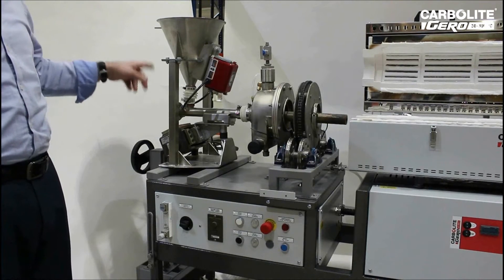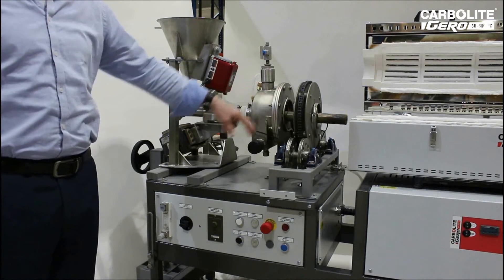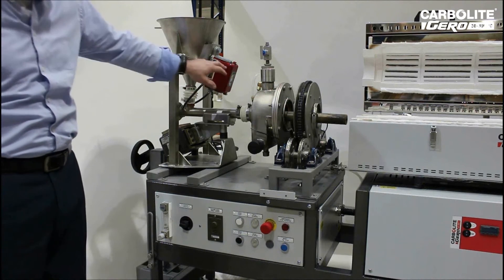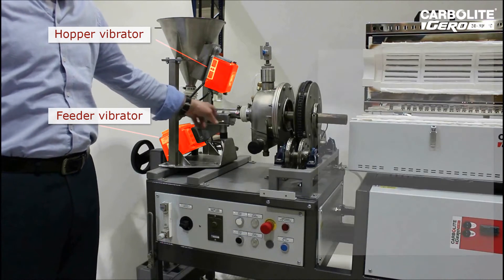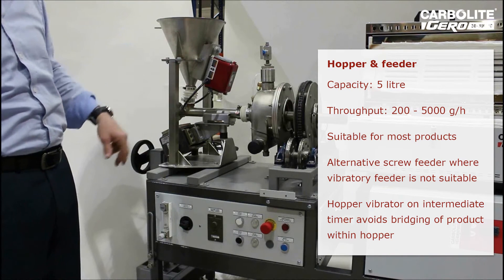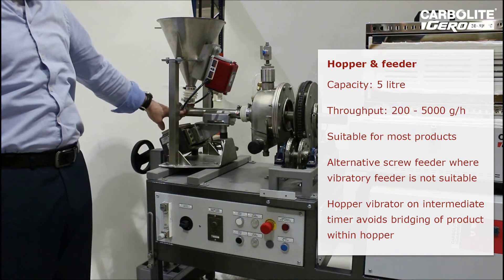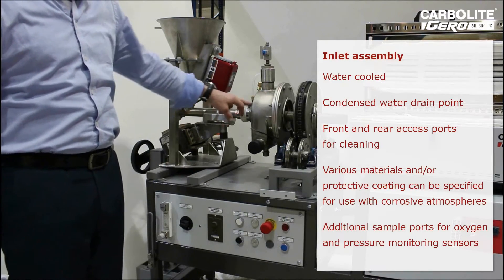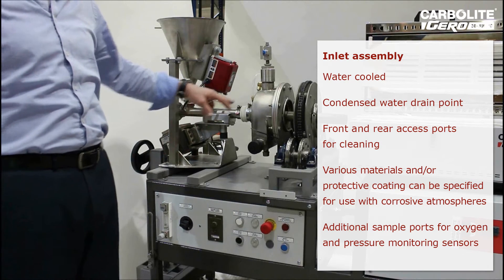We're now looking at the vibratory feeder, the inlet assembly, and the drive system. The vibratory feeder is the industrial tank with two vibrators: the main one which transfers the product through the tube and into the work tube, and the secondary one which ensures that the product from the hopper flows down into the primary feeder tube. The inlet assembly is water cooled when operating at temperatures above 900 degrees C.